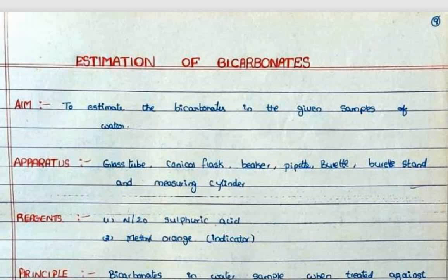Aim: to estimate the bicarbonates in the given samples of water.